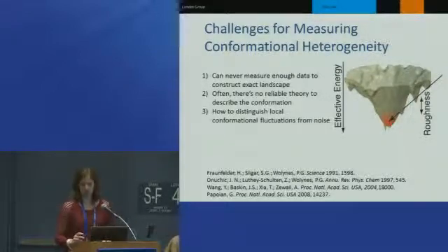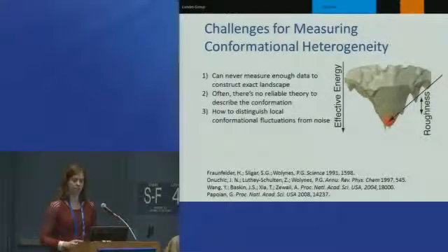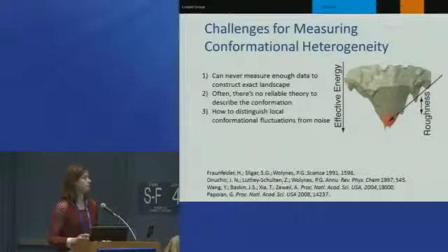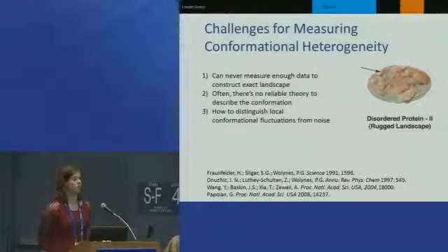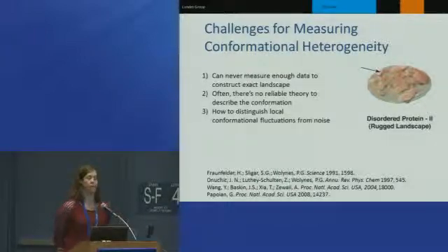And that's what happens all the time with chromatographic separations: you get your elution curve and you fit it to some version of the Van Deemter equation or something else. But in these types of systems, of course, you can't fit to any particular equation. There usually isn't a theory. So you don't have a theory to fit to, but then you would have to collect Avogadro's number of data points to collect this all experimentally, and that's not possible either.